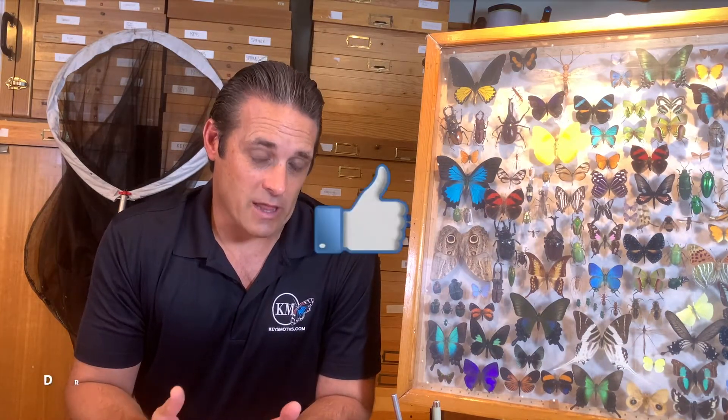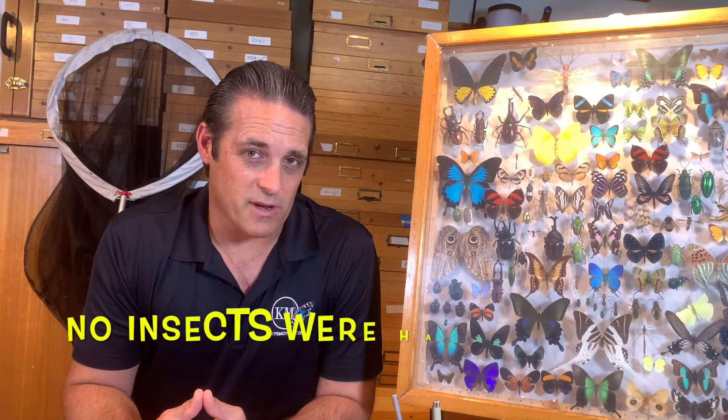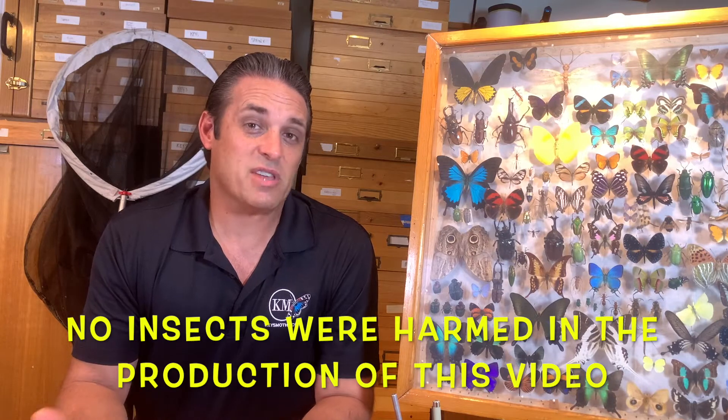What we do at Keyes Moths is scientific research, and there's a tremendous value in the collection of Lepidoptera. If it weren't for collecting, particularly moths, we would be missing out on all kinds of new discoveries. Just in the last few years in the Florida Keys, we've identified several new species to science, and we would never have been able to do so without putting some traps out and collecting a few specimens. We only take what we need, and we do so as humanely as possible.